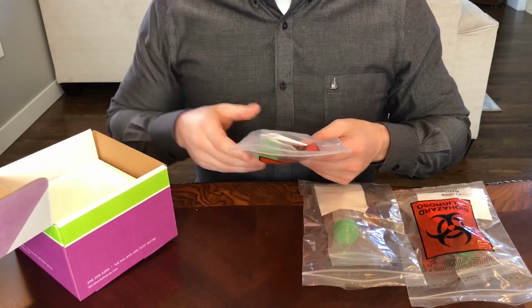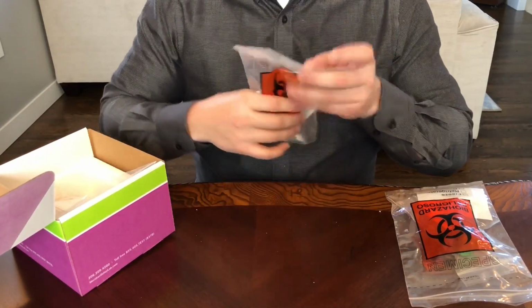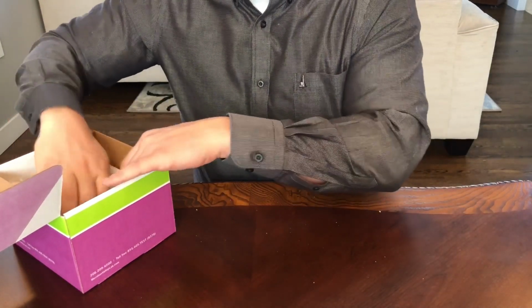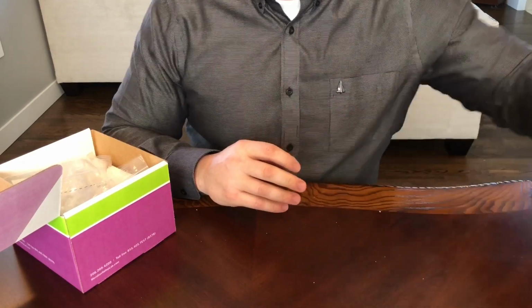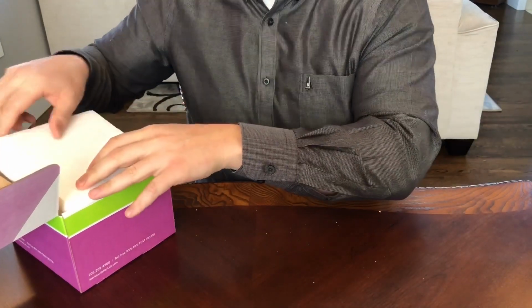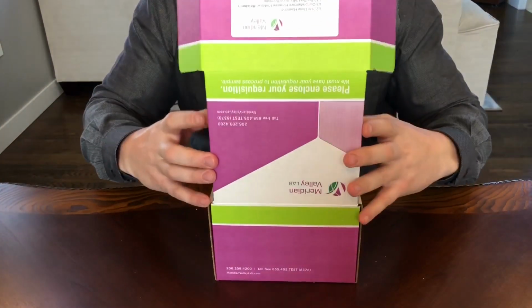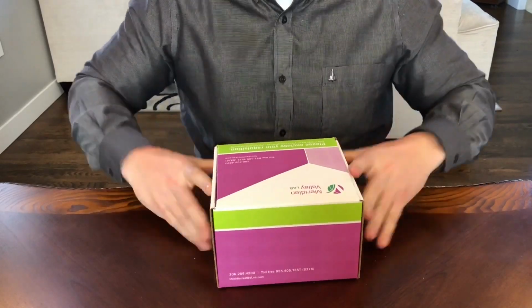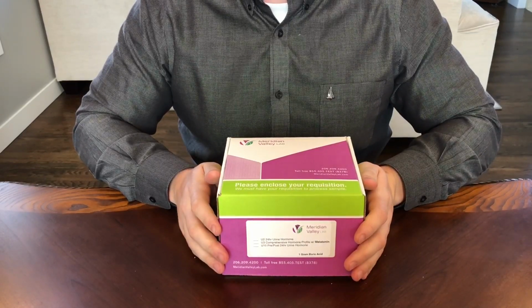Next, place the bags in the styrofoam container. Take the lid with the cold ice pack from your freezer and place it on top. Close the box. Place the entire box into the provided mailer and send back to the lab.